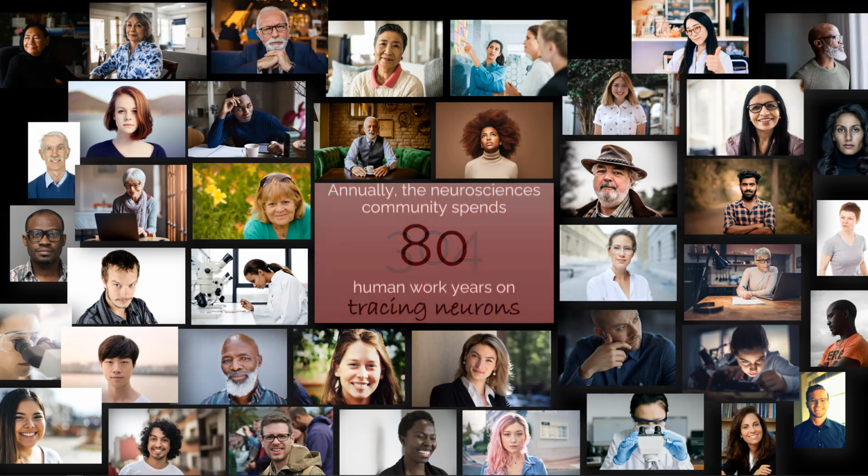We think that we can reduce that using Aivia to just 80 human work years tracing neurons. And that means there is more time for critical thinking, more time to rest, more time for leisure, more time for reading, whatever is the right answer for you. But there is less time of repetitive work that Aivia can do for you.